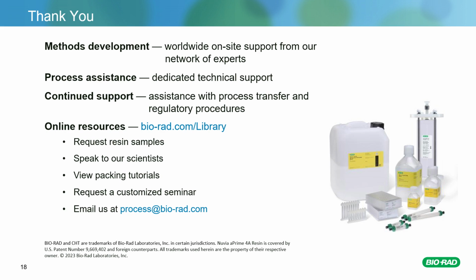As I mentioned before, selection of the DOE design is driven by the number of factors to be tested, but also important is to know how many chromatography runs you can afford. So knowing these two factors, you can put them in the software, and this will provide you with the best design matching your requirements.